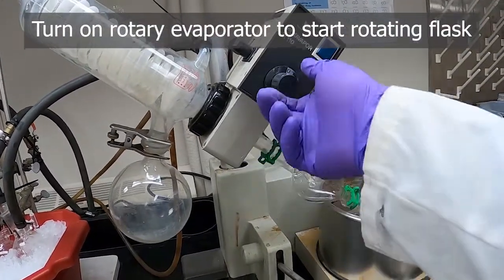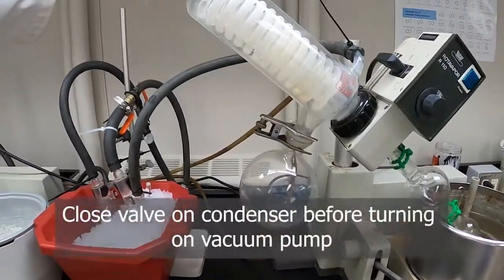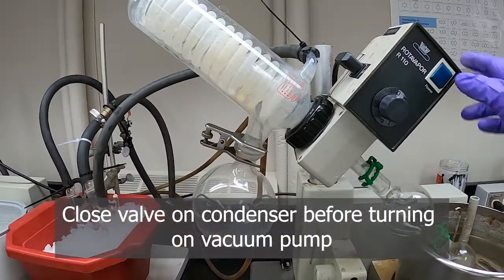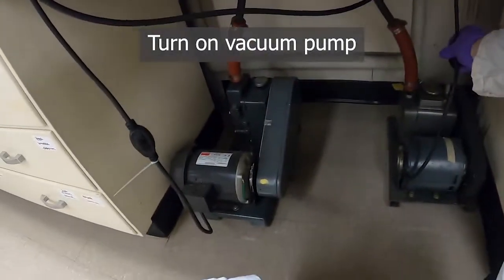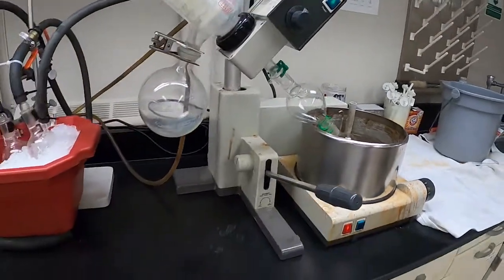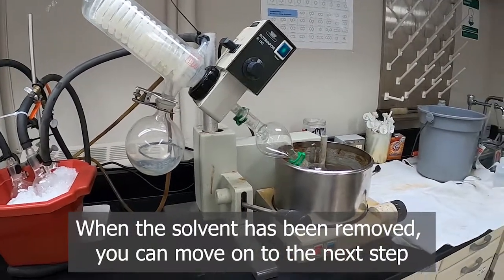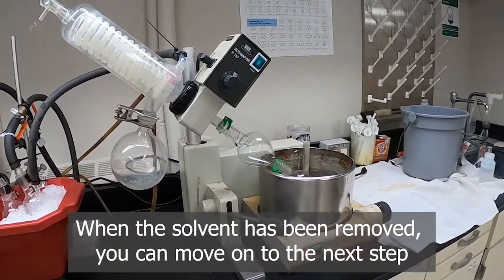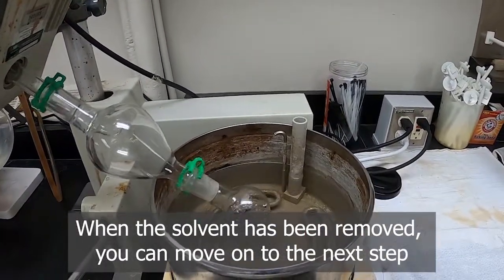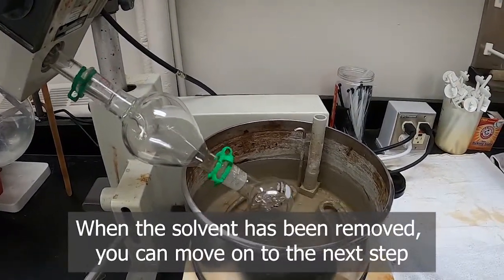So first we will close off our vacuum. We've got to close this valve up here at the top to seal it for vacuum, start our rotation, and turn on our vacuum pump. Alright, and when that's pumped down, we'll be ready to do the next step. The solution is boiling now, and we'll have it evaporated off soon.